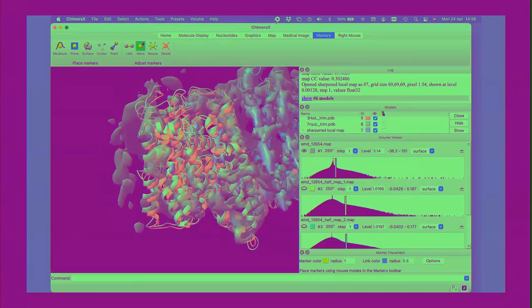Now, I forgot to mention the LLG score that's disappeared off the top here was 61, which is just barely over our 60, but it was the only high peak in there. The local map correlation is 0.3. So it's finding something that you can't see by eye because there are features that don't show up in connected density.